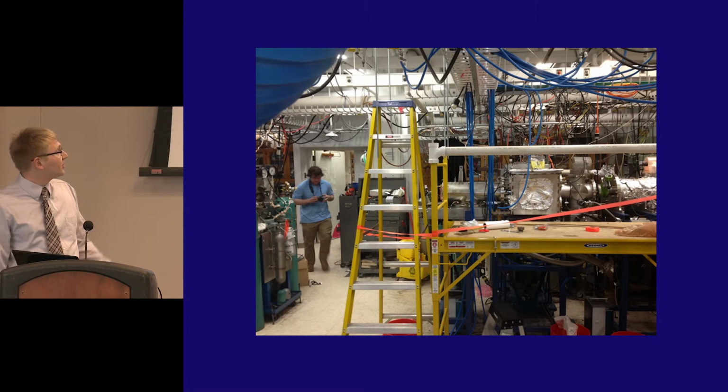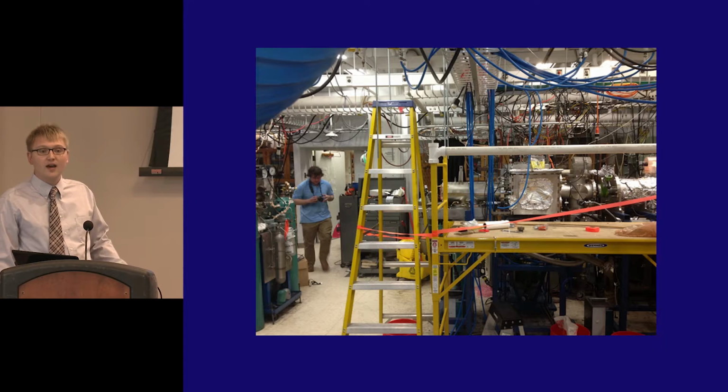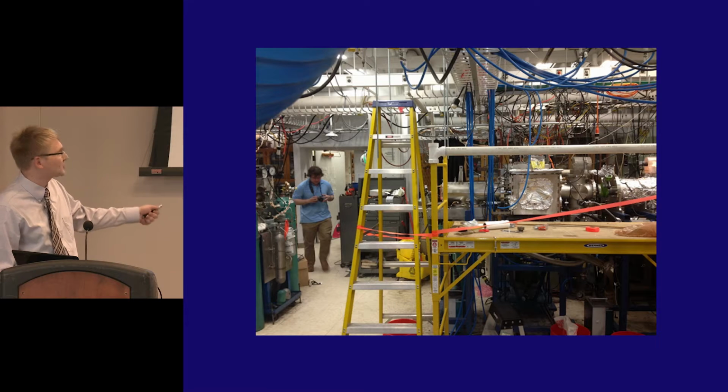So as you can see here, the photoelectron spectrometer, at least the front half of it, is already existing. We can see it right here in this picture with these stainless steel chambers. However, what's eventually going to become the electrospray is currently taken up by this set of scaffolds, ladders, and caution tape.